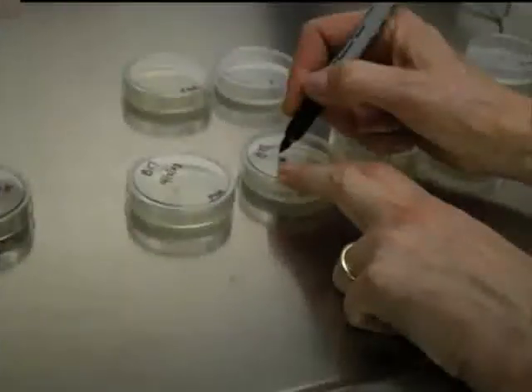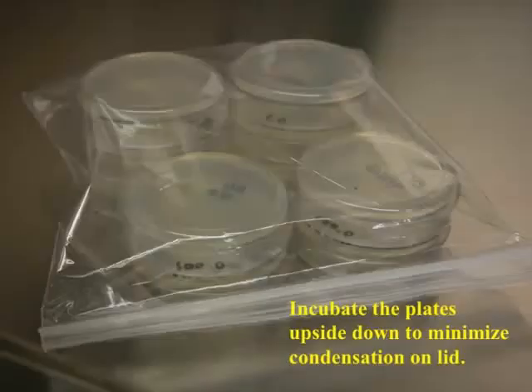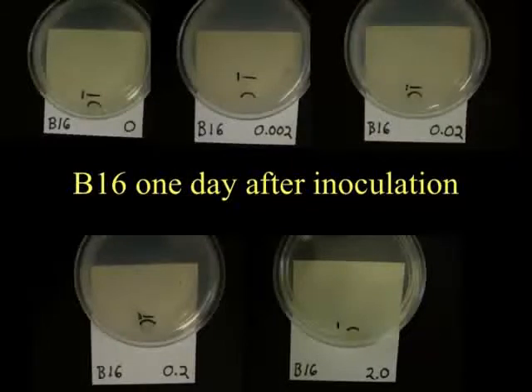We labeled the plate with the isolate number and the fungicide concentration and date. Once the plates were inoculated, we put them into a plastic bag upside down. If you incubate them right side up, you get a lot of condensation on the lid of the plate, and then it's difficult to see the fungal growth. So then we incubated the plates for 1 day, and then we used a marker and marked the curved edge of the inoculum block, and we used a straight line to mark the edge of the fungal growth. And we did that for each plate.